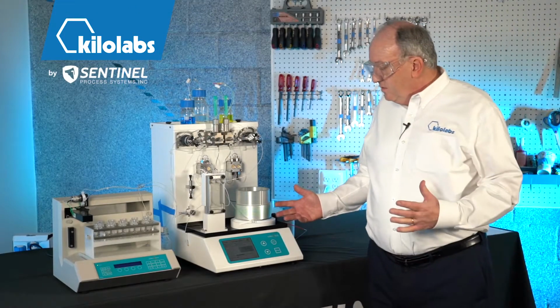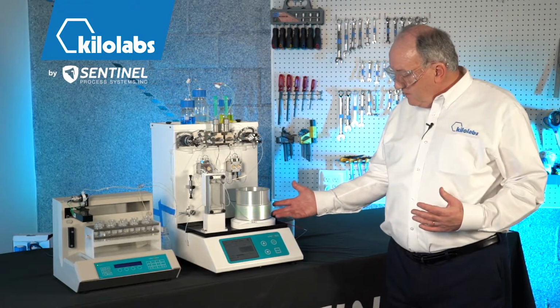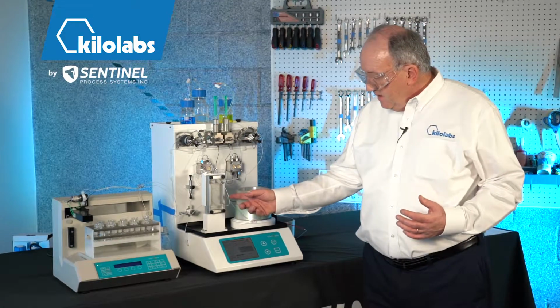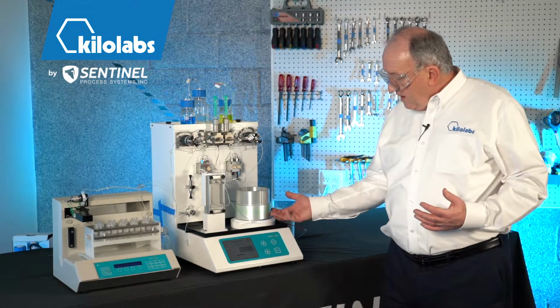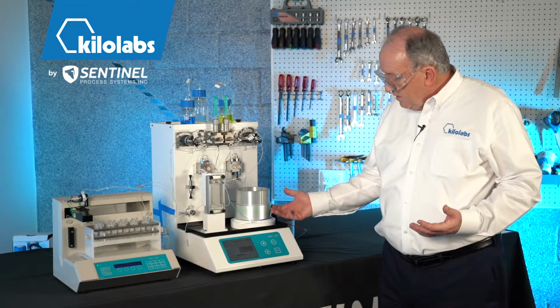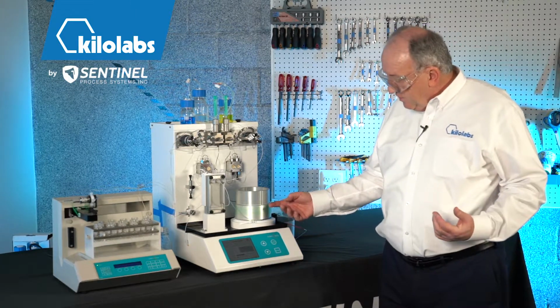Now we're watching the fluid go through the coil, and it's almost reached the top of the coil. It's still waiting to get to the collection valve. As you can see, the solvent has cleaned out the mixing chip entirely, and the 4 ml on the coil is still being slowly pushed out. It's a little less green at the very bottom. That's the end of the dispersion plug.